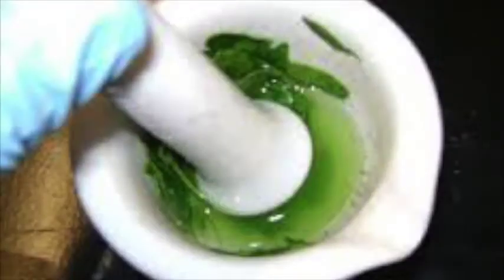If your sample's a solid like leaves as shown here, then you can try just adding a solvent that your sample likes, typically in a mortar and pestle, and then grinding your stuff up with that solvent and then pulling that solvent away. Now a really important point here and throughout the entire extraction is if you are trying to pull your sample into a solvent, you want no solids. You have to be very, very careful to have no solids.